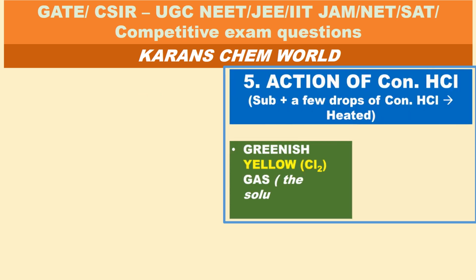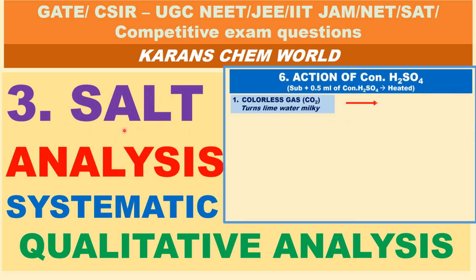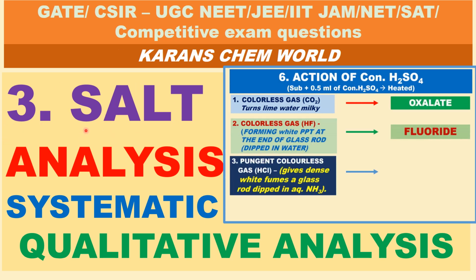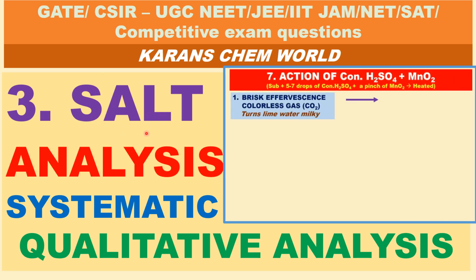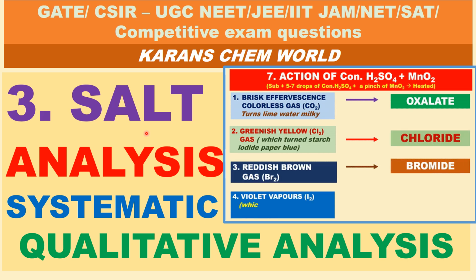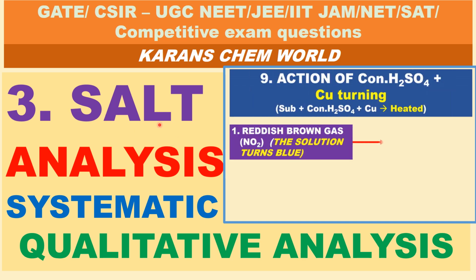In this video, we'll see part 3. We have already discussed action of heat, action of dilute HCl, flame test, etc. In this, we'll see action of concentrated HCl, how the substance reacts with concentrated HCl, and the concentrated sulfuric acid test.